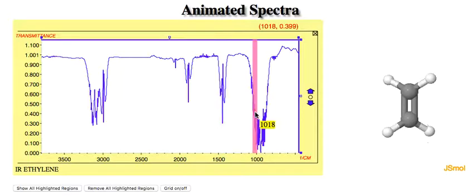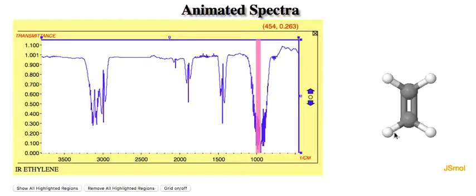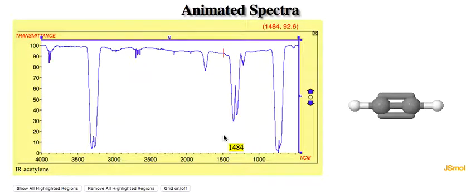There we've got a twisting mode going there. And here we've got an out of plane wagging mode.